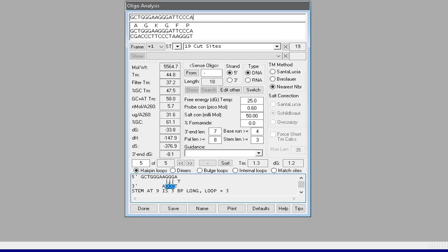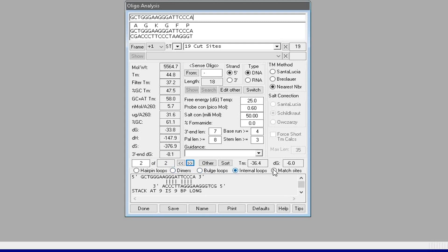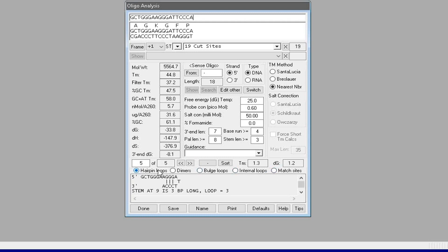In addition, the software also detects four dimers at different temperatures, one bulge loop, two internal loops, and zero match sites. Since this particular primer sequence has five hairpin loops, this primer pair set can be avoided.